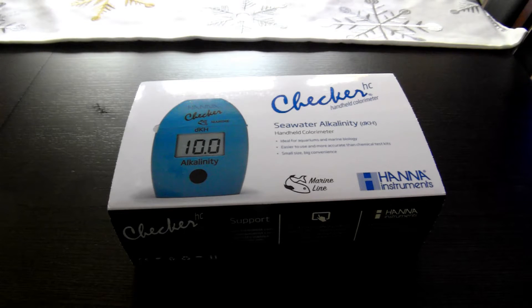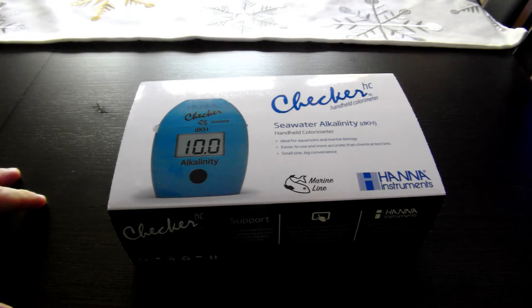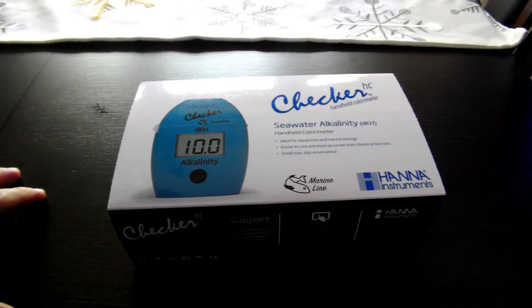Hey folks, I just picked up this Hanna Checker for my reef aquarium to measure alkalinity levels. Got a good deal during the Black Friday Cyber Monday week and also had a gift card I was able to take advantage of.